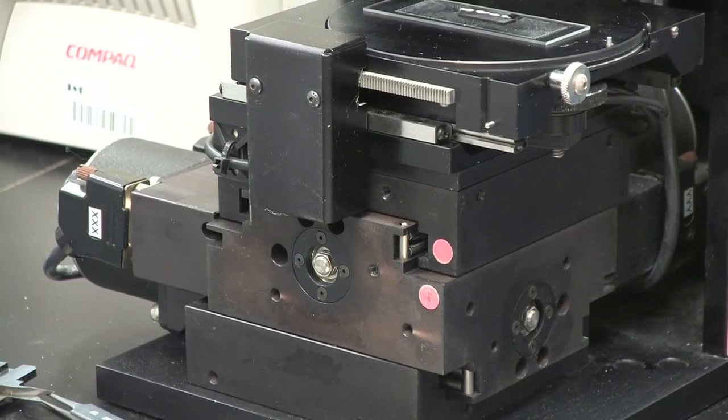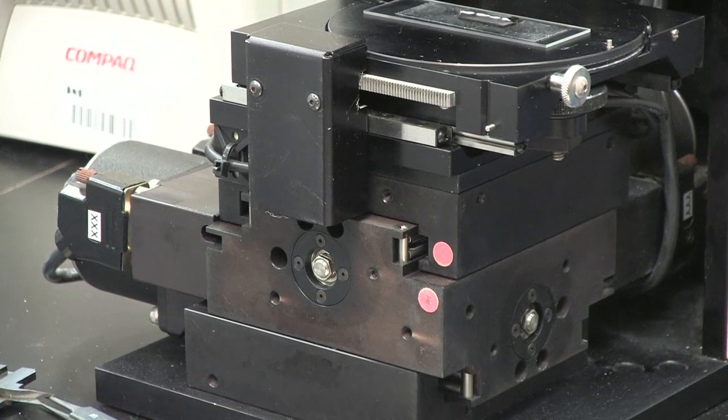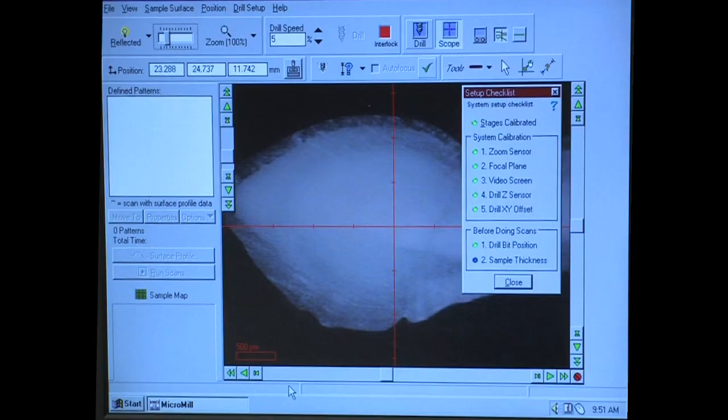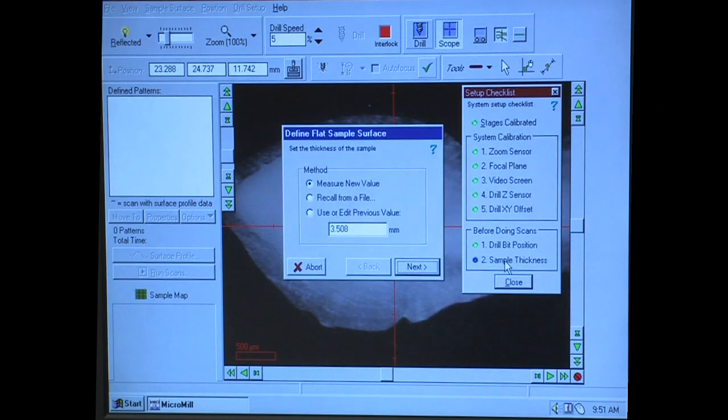It uses a three-axis stage for positional accuracy to one micron. All operations of the micromill are controlled by the user through the computer. In addition to this video, the black binder beside the micromill computer has all the instructions listed.